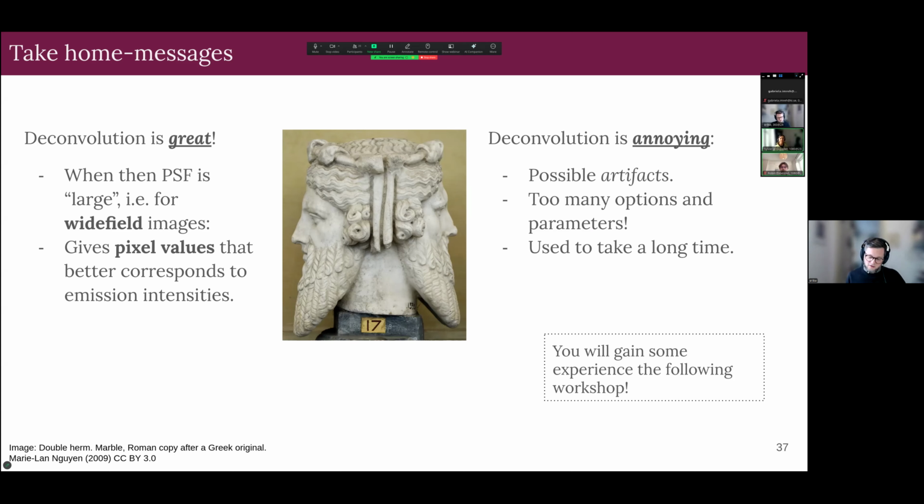There are later developments that bring down the number of iterations that have to be used to get the same result. I would start there, and unless there are specific reasons not to use it, I would stick there. That should be the vanilla choice. That's where you would start.